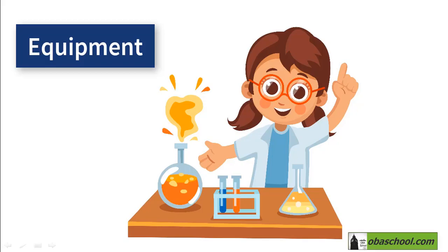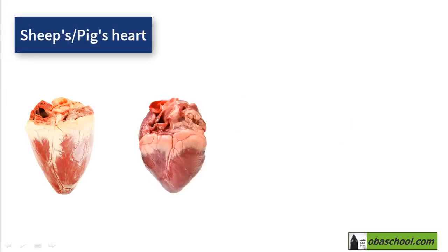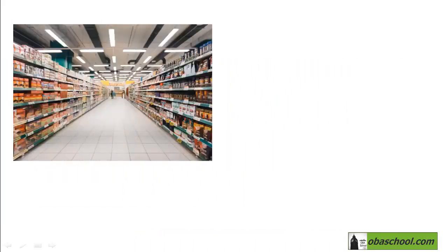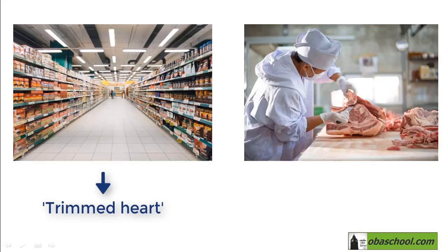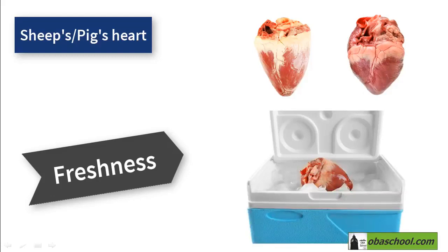So for this experimental procedure, we need a sheep's or pig's heart. It's similar in size and shape to the human's heart and can be bought pre-packed from supermarkets. But they are trimmed, meaning that blood vessels and atria have been removed, so it's better to buy it from a butcher since he can supply us with an untrimmed heart. Keep in mind that the most important factor is the freshness of the animal material. So any animal material to be used should be kept in a sealed container and stored in the fridge.